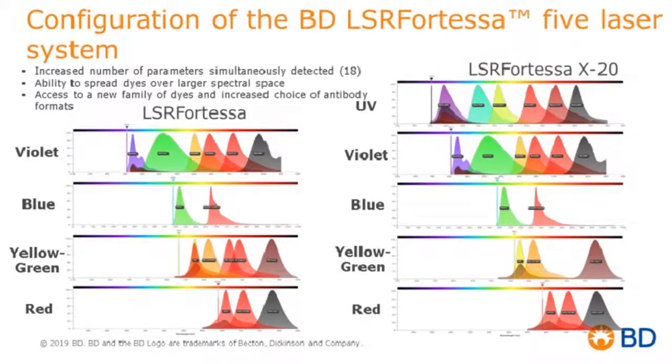And that allows us to have an easier panel design because now we have more choices, more opportunities and more dyes that we can utilize, and it increases our quality of data when we can spread out the dyes and minimize the spillover. So for example, you can see that we can use a combination of these dyes.